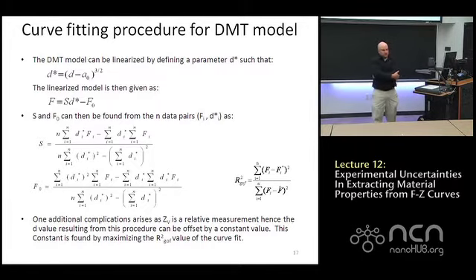Well, it's not really part of the fitting process. It's kind of separate from it in the fact that we're saying that we're going to maximize R squared. So choose D equals 0 such that R squared is maximum. What you can do is do many fits for all choices for D equals 0, and then choose the one with the highest R squared.